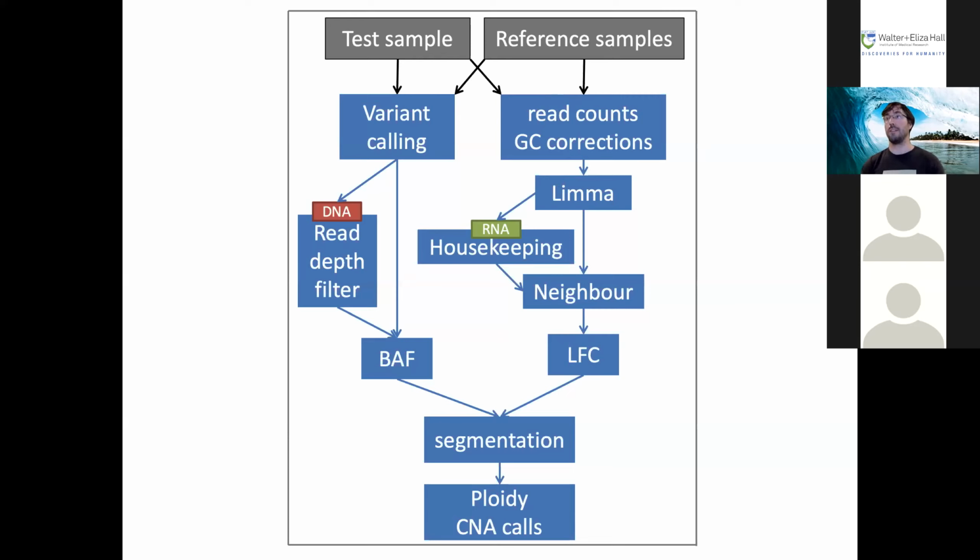Many people in the audience would have done differential expression analysis and know all the things here. And I'm going to reuse a lot of that machinery. In particular, I'm going to use limma and voom to study the differences here.